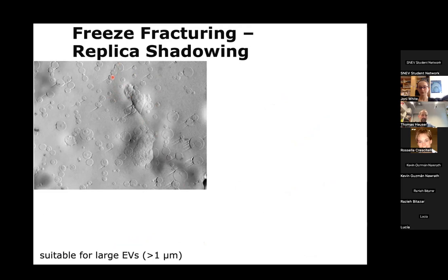These here are no extracellular vesicles. This is basically an emulsion we got from a collaborator who mixed oil and water phases. So you can think of this like a very big special liposome. And this method is especially suitable for very large samples, which might be a problem.